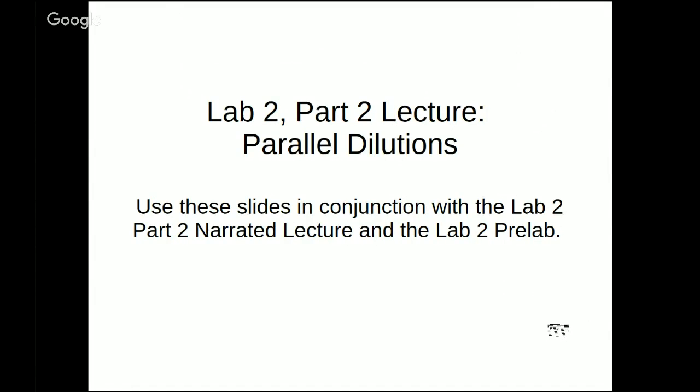Okay, welcome to part 2 of Lab 2. In this lecture, I'm going to teach you how to do the calculations for parallel dilutions. You should use these slides in conjunction with the Lab 2, part 2, narrated lecture, and along with the Lab 2 Prelab. If you're going through the Prelab and you find that you're having trouble with parallel dilutions, you can consult this lecture. Hopefully it will help.